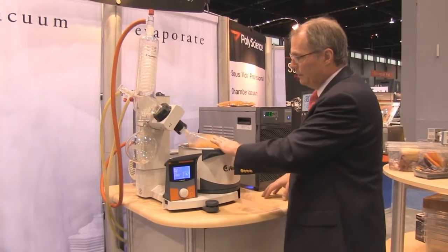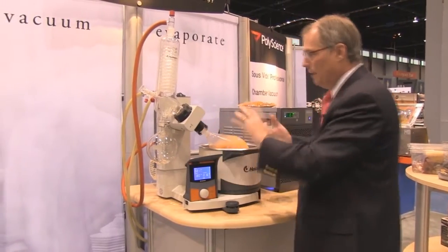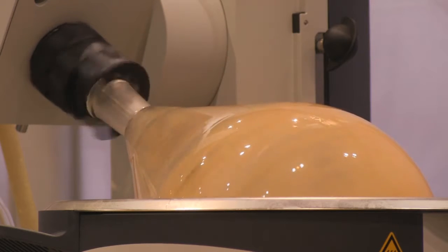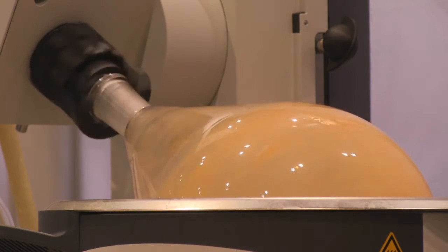The product boils from this flask, which rotates to increase surface area and enhance the phase transition. It boils, condenses on the coil, and collects here.